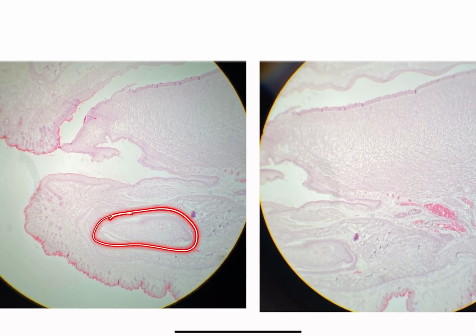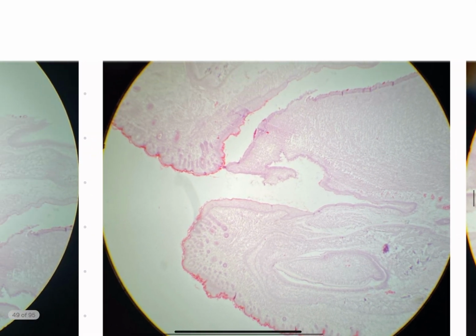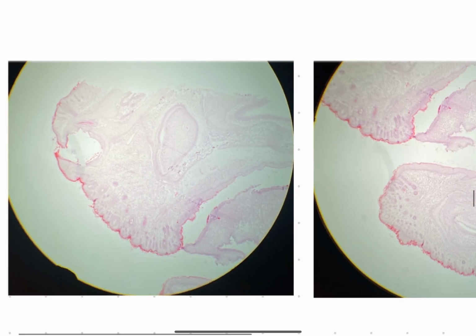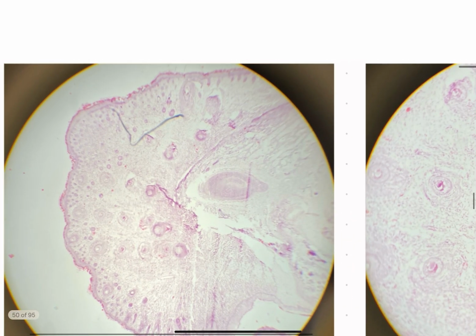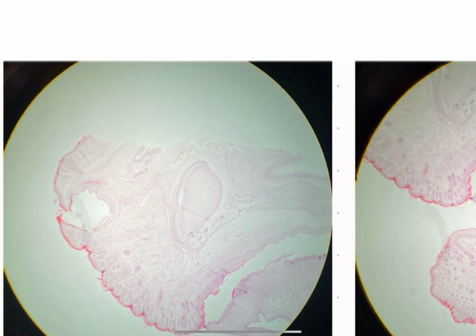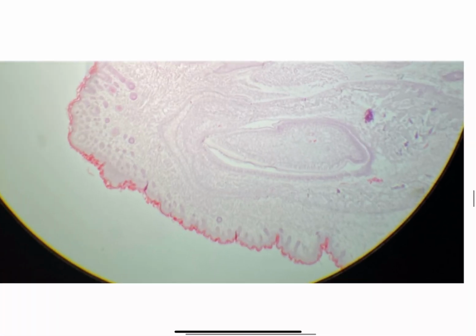This is the late tooth development, so we have the enamel and dentin there. In this case, we can also see that keratin at the top of the epiderm. But here, when zoomed in, we see those, I would say almost whiskers, but hair follicles is enough. So all of that and all of these smaller ones as well. Do we see the nose development? I'm going to say no. We can see another late tooth development right there, but nothing else in this structure specifically.